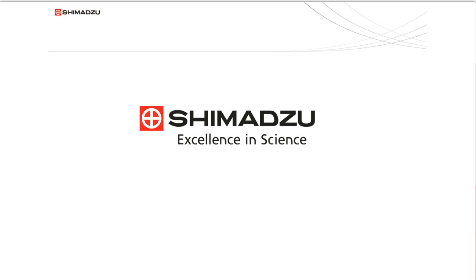Same thing goes with basic modifiers. And then there is also a school of thought of using mixed modifiers. There are some people that swear by using a combination of both an acid and a base, so almost zwitterionic, if you will.